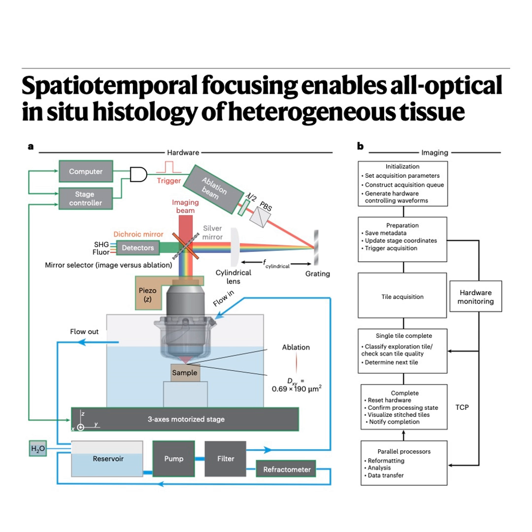That's the key. Precisely. Like imagine mapping a whole mouse brain while it's still sitting inside the skull, that hard, bony structure, and doing it all at submicrometer resolution. Wow. That level of detail has been the dream. But it sounds almost like science fiction, doesn't it? Well, for decades, it really has been one of the biggest technical barriers out there.